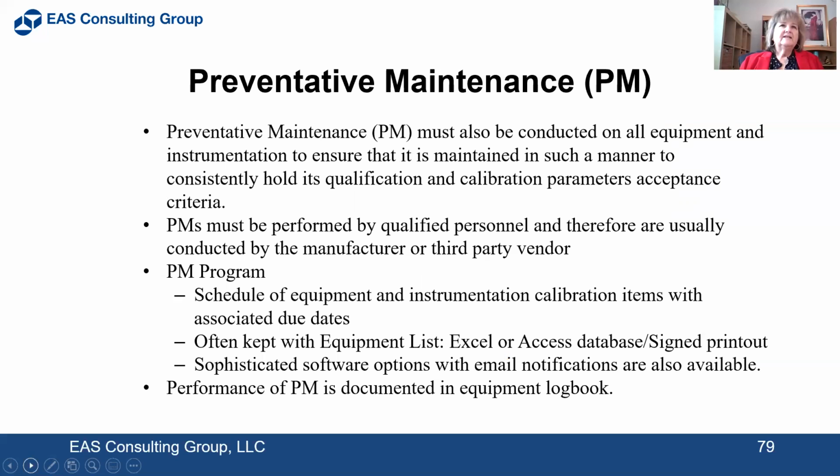Preventative maintenance must also be conducted on all equipment and instrumentation to ensure that it is maintained in such a manner to consistently hold its qualification and calibration parameter acceptance criteria. PMs must be performed by qualified personnel and therefore usually conducted by the manufacturer or a third-party vendor. You can do that, or you can get somebody who's working in the lab specialized training to be able to perform that also.